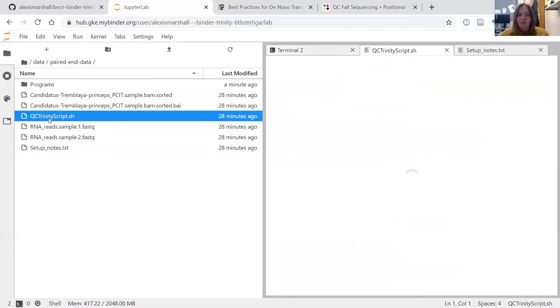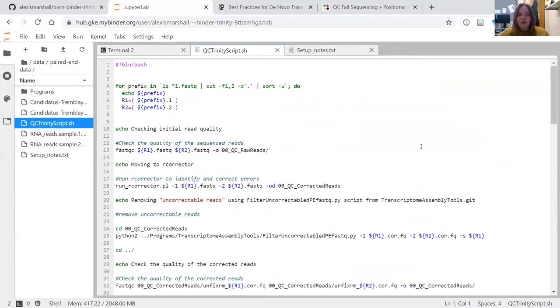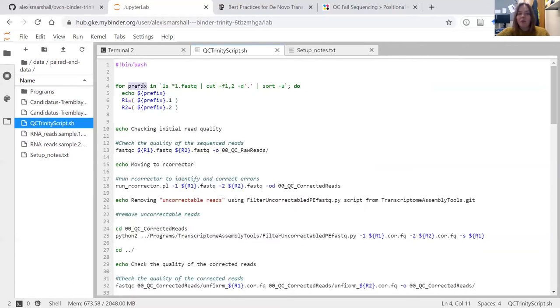If we open up the QC Trinity script, you'll see a for loop. For those who haven't come across a for loop before, the basic description is: as soon as you type 'for', you open up a loop that goes through and makes a list of anything you want. I've called the variable 'prefix' here because it's easy to work with and a lot of our other lessons have used this naming convention, but you can call it anything you want.